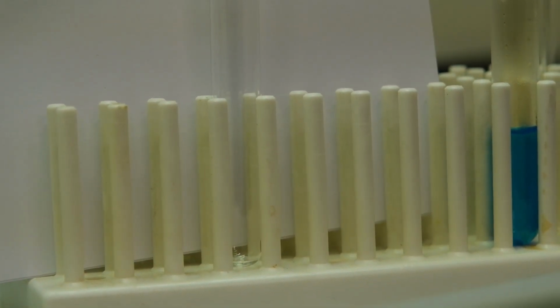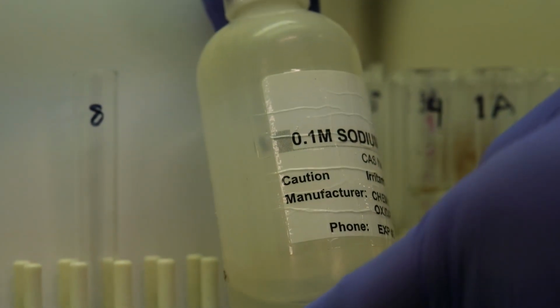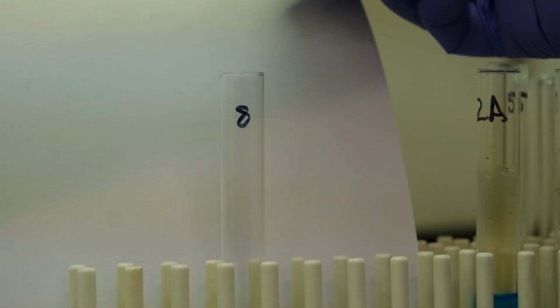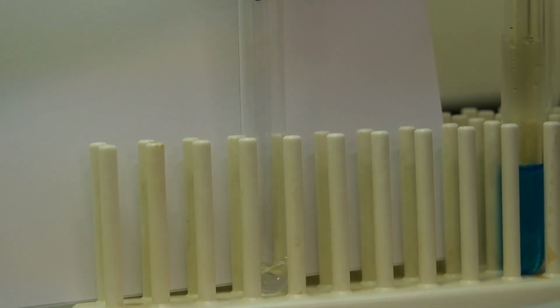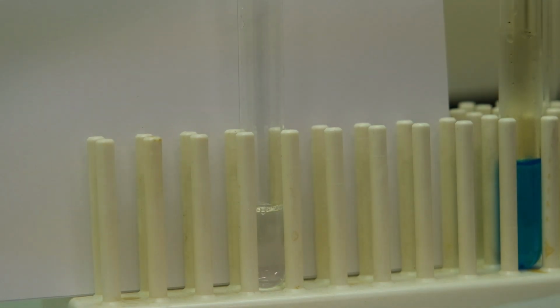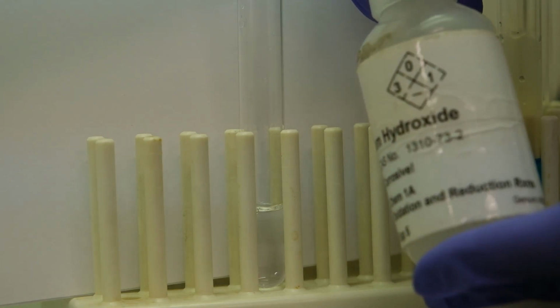This is for experiment 5, system 3C. First we're going to add approximately 2 milliliters of the 0.1 molar sodium bisulfite. Now we're going to add approximately 1 milliliter of the 6 molar sodium hydroxide.